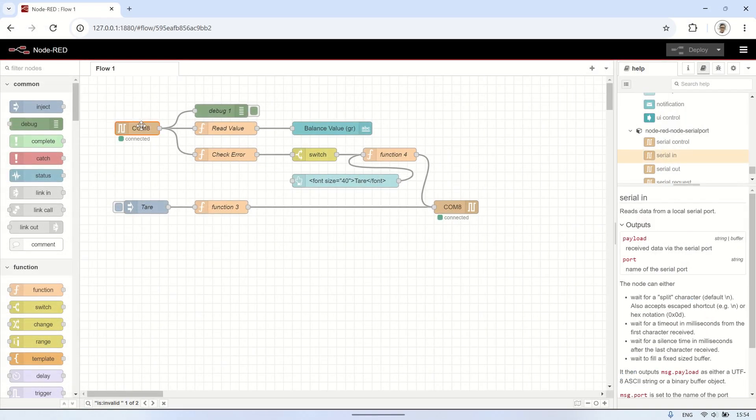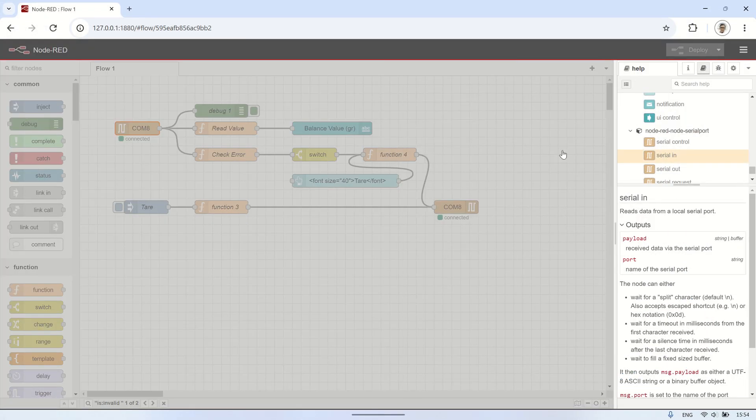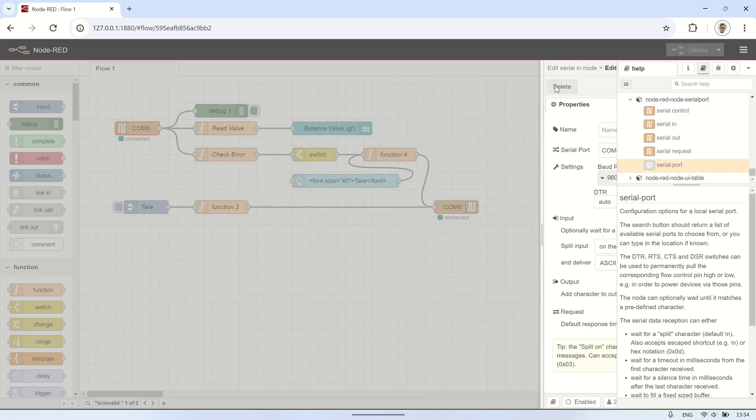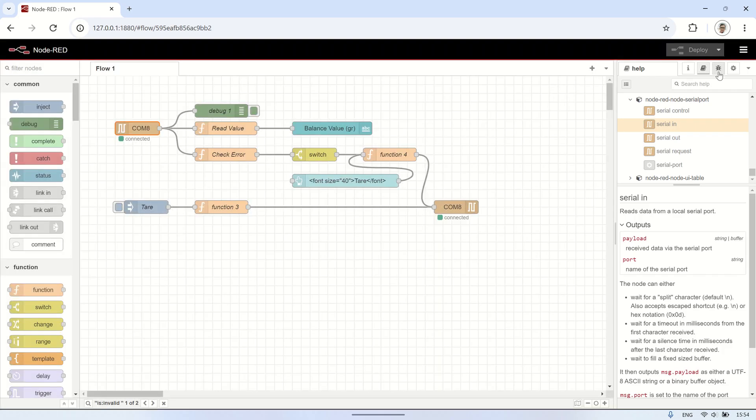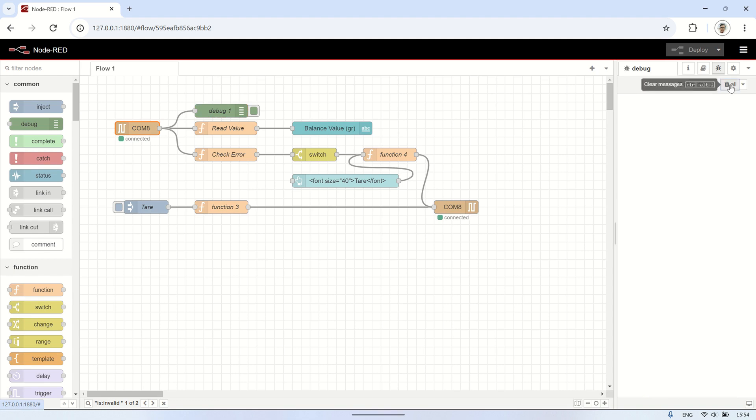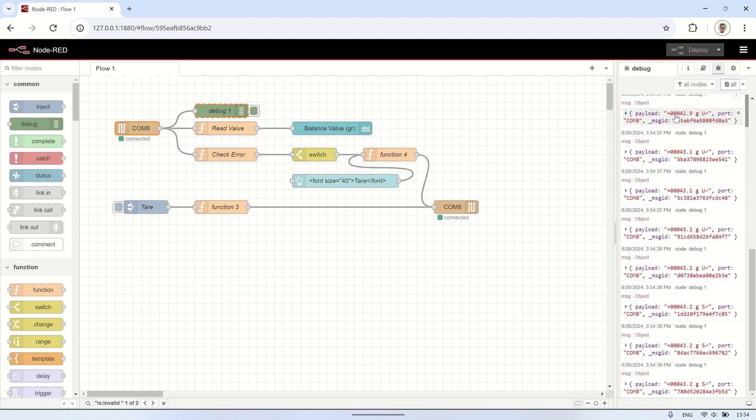Next, here's a slightly more complex flow. We're still using the serial in node to read the balance's measurements. In this example, the value shown in the payload is not just a pure number. Instead, it follows a specific format: starting with a plus character, followed by numbers beginning with zero, then 'g' as the unit for grams, and 's' indicating that the reading is stable.